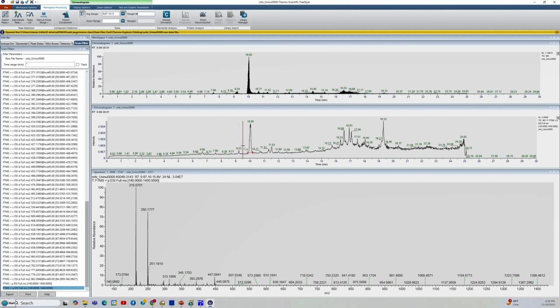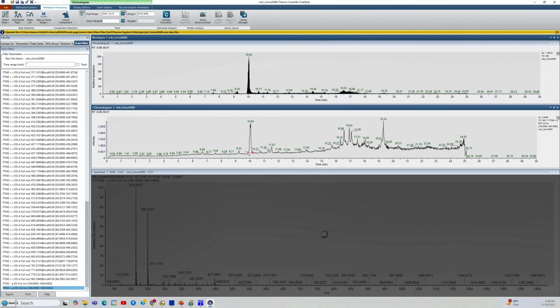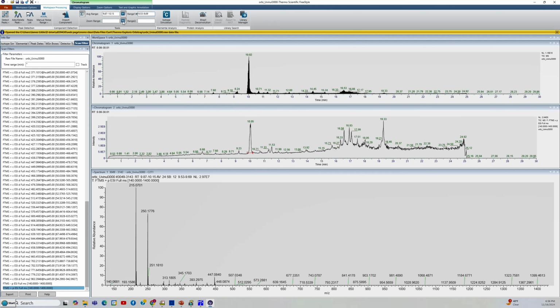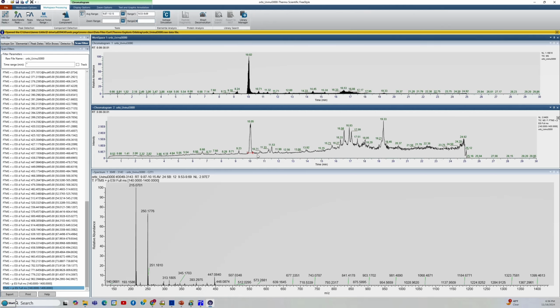We go to S1 and make sure the box is highlighted up here. If you know it doesn't work, you can see it's got a -1. It's going to take that range and subtract it out. We're going to do a second range in back of the peak. Again, you have to click in this box before you go down, and now a 2 will appear. And so you have the average spectrum here for that.